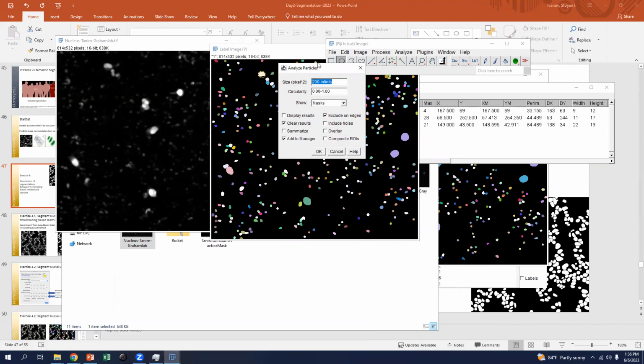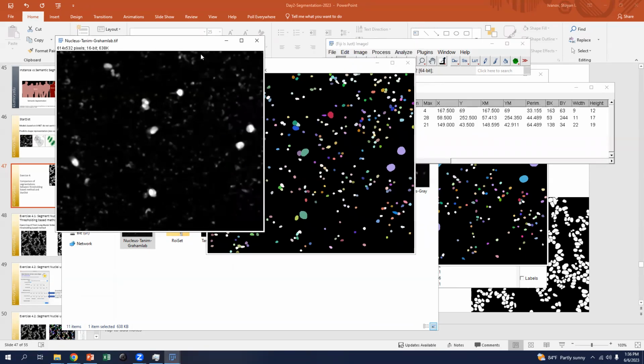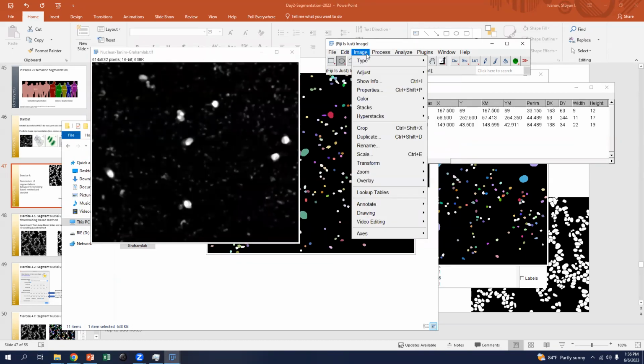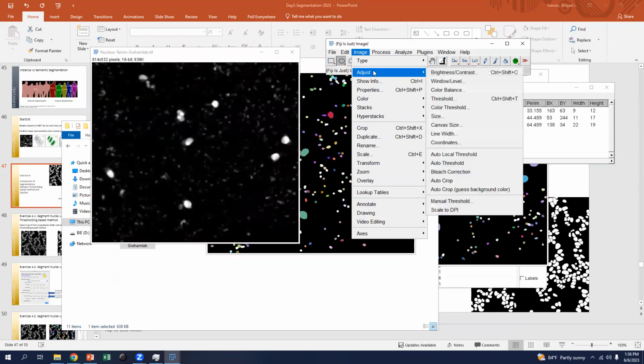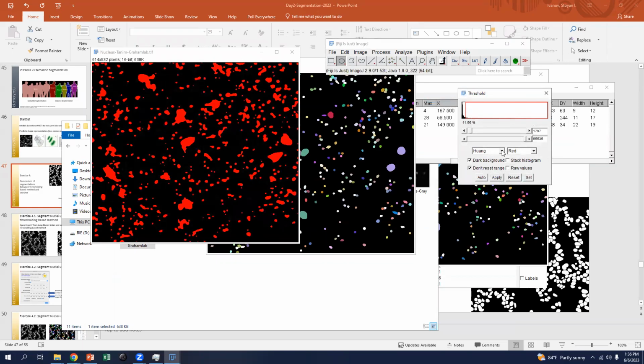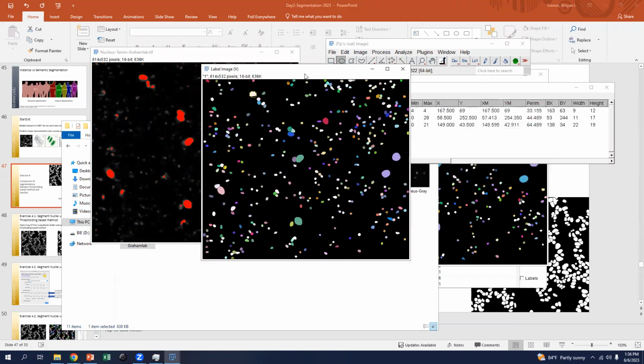We also want to clean up the manager. Yes. I got too excited. I skipped the, what did I skip? Thresholding. But actually, we don't need to because we used StarDist. That's why. What am I missing?